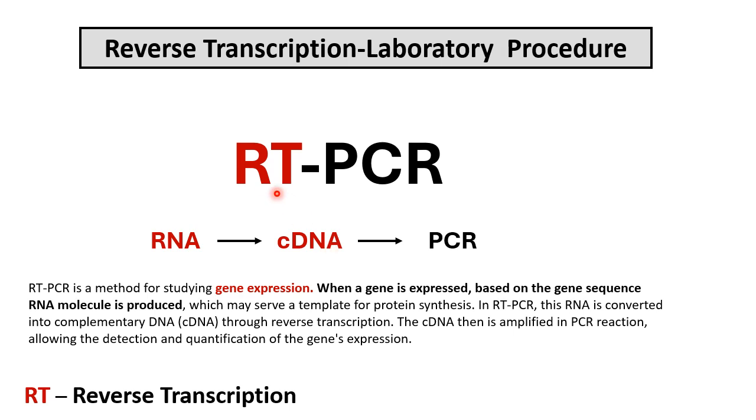So definitely RT-PCR is a method to analyze gene expression. If we ask the question, is the gene expressed? So, is the RNA molecule produced based on the gene sequence? We will apply the RT-PCR method.